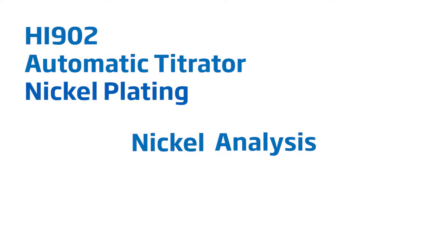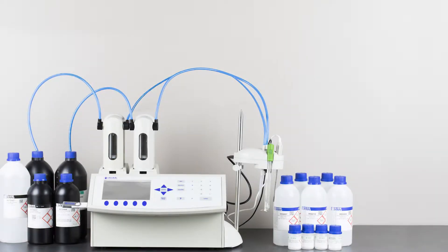Nickel plating bath analysis is easier than ever with the Hanna HI902 Automatic Potentiometric titrator. With the automatic titrator, results are just a button push away.